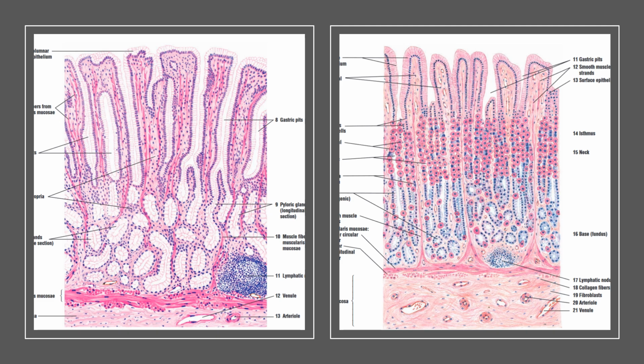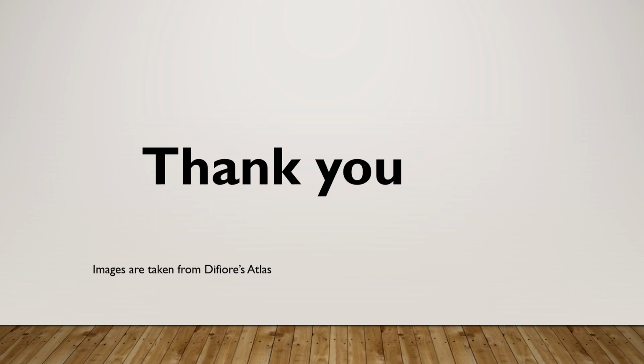So with these ideas, please see the slides of esophagus, stomach fundus and pylorus. Get that mental picture. Then you read whatever points are given in the record. Then you draw the diagram. Then only it will be easy for you to remember the slides. Easy for the discussion also.